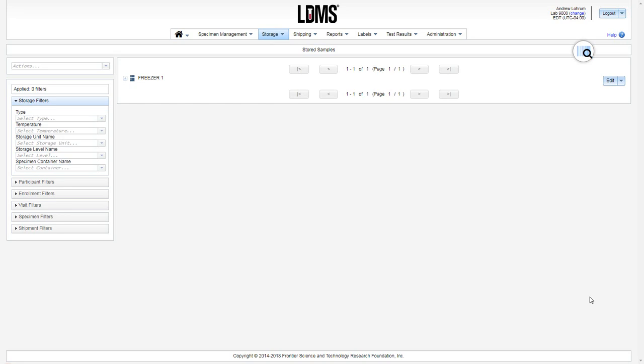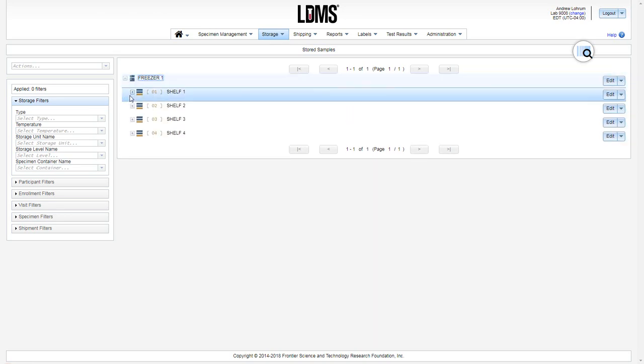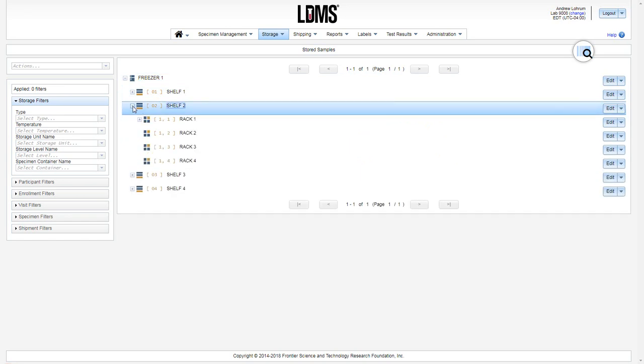This video tutorial will cover how to add a new box and specimens into your virtual freezer in WebLDMS. On the stored samples page, expand the freezer until you find your destination rack.